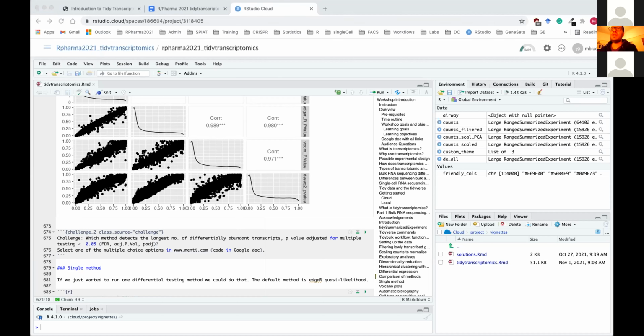Well, so the ellipsis arguments, the three dots, plus whatever arguments to the DESeq2 fit function. I don't know specifically how the LFC is requested in DESeq2, from which function. I'm a bit more experienced in edgeR, I have to say. But let me see, one second, while we wait for the quiz.